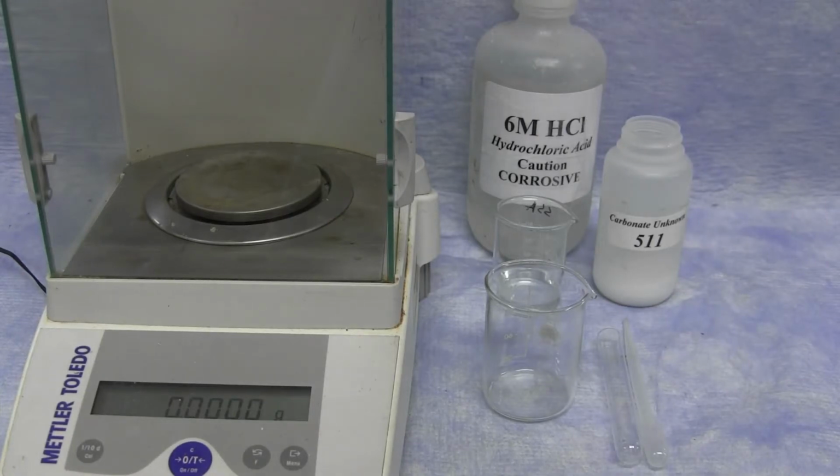All of the reactions in this experiment are performed using various carbonate samples and hydrochloric acid. All of the setups are going to be exactly the same, whether you're measuring the percent carbonate of baking soda or baking powder or an unknown carbonate.